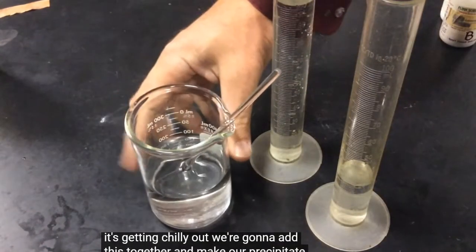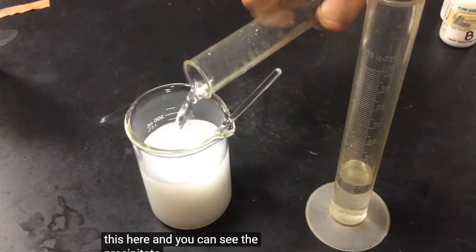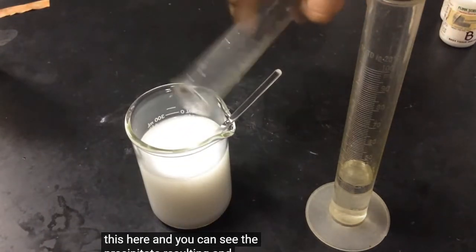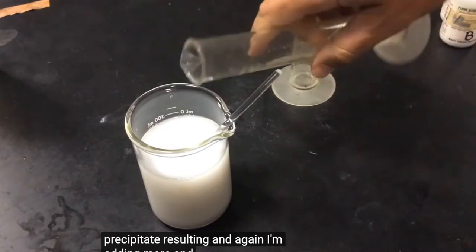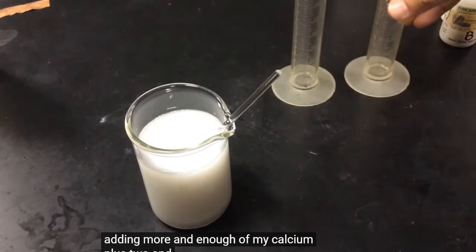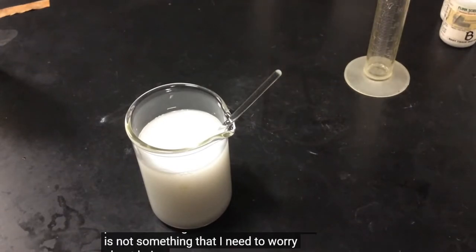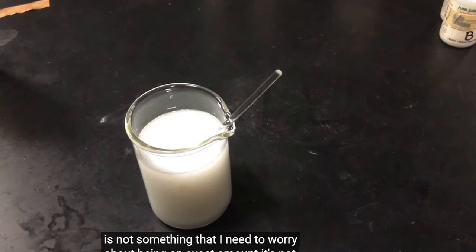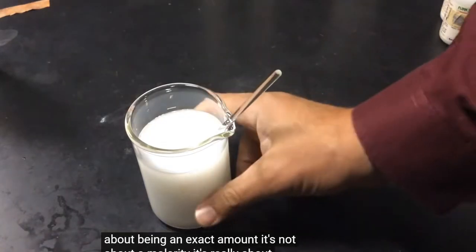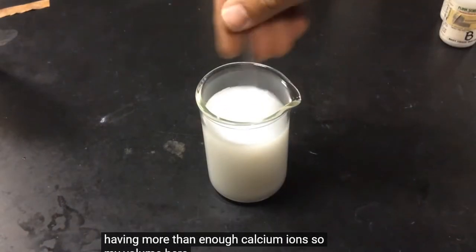I'm going to pour this here, and we can see the precipitate resulting. Again, I'm adding more than enough of my calcium plus two. The calcium chloride is not something that I need to worry about being an exact amount. It's not about a molarity. It's really about having more than enough calcium ions. So my volume here really isn't all that important.